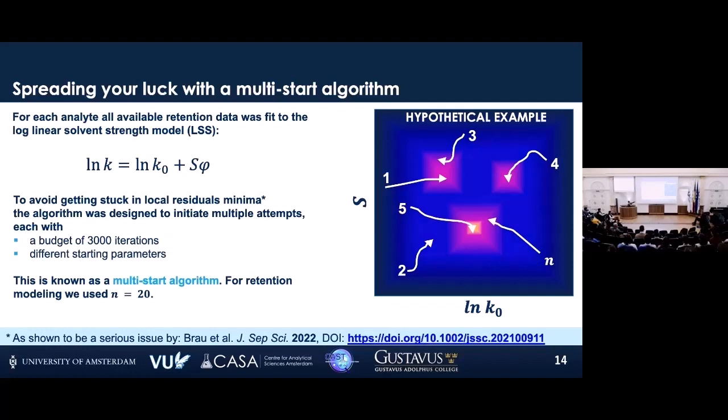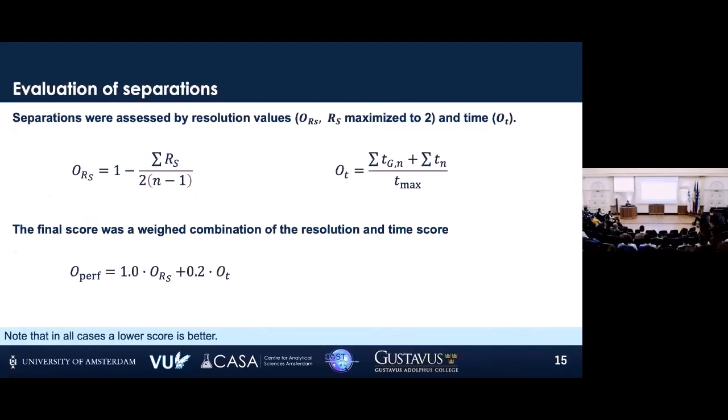And this is some way you can do this here. Now, for the retention modeling, this is not so special, but for the actual optimization of the separations, it is more crucial, and I will get to that. But before I do so, I first want to depict another problem.